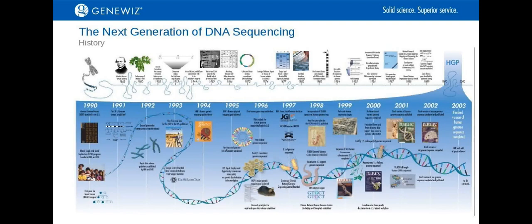The Human Genome Project, probably one of the most significant achievements in human history, accelerated the need for higher throughput sequencing. In comes next-generation sequencing, or NGS. In the beginning, this method had quite a few drawbacks, including read length. As a result of the high cost of NGS and low throughput of Sanger, the Human Genome Project took over 10 years and $3 billion to complete.